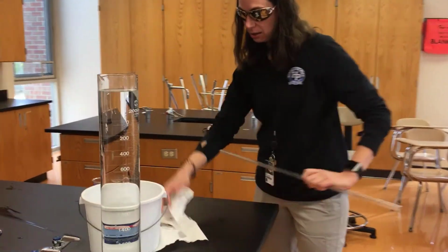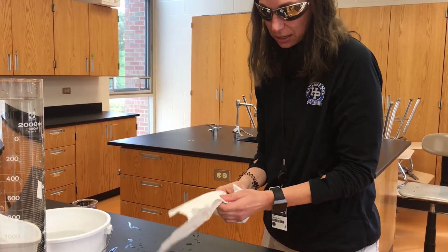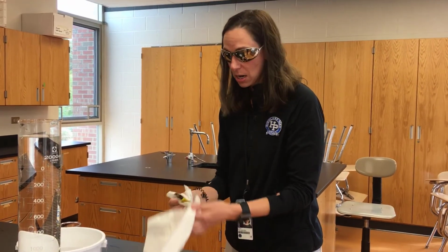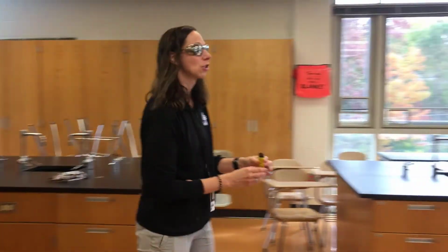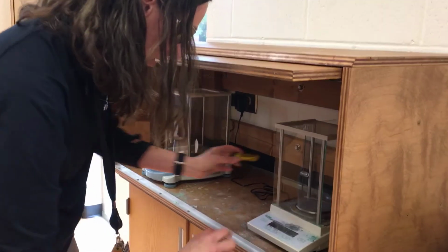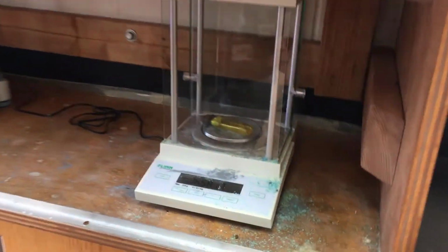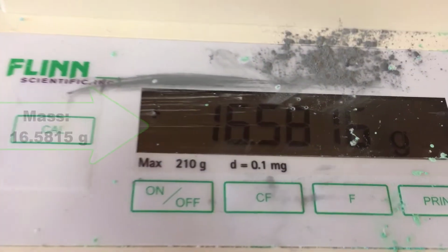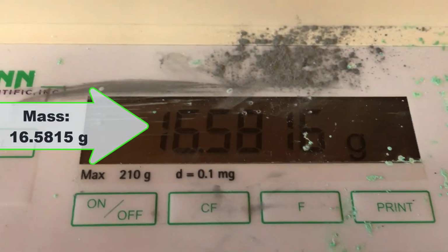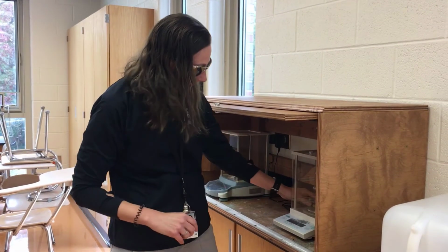And again, I'll dry off the lighter so we can get our difference in mass here. And we will also give you data from the barometer so that we can get temperature and pressure for the room. So here, let's tare it. And now we're down to about 16.5815. Okay, so that's our first trial.